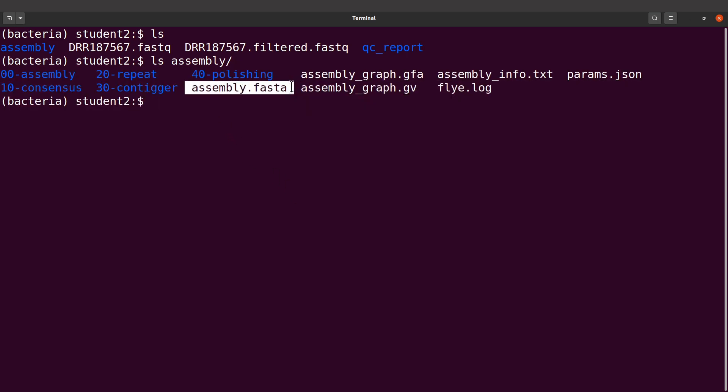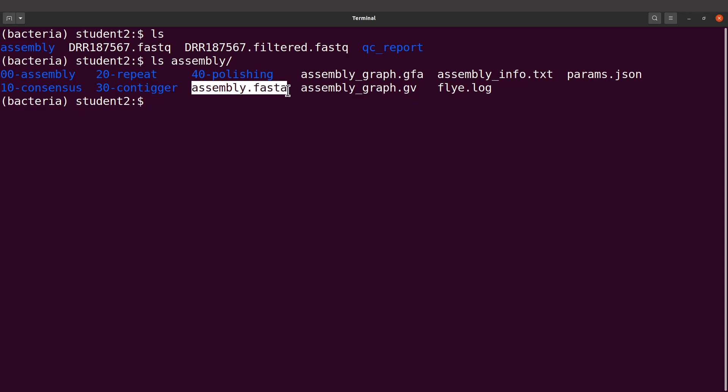I'm going to run QUAST and supply it with this file because I'm going to evaluate this assembly. To run QUAST, if you installed using mamba, then it has to be QUAST.